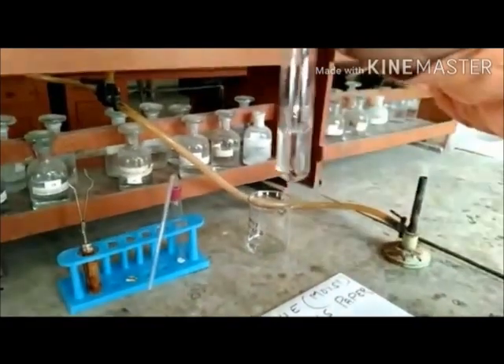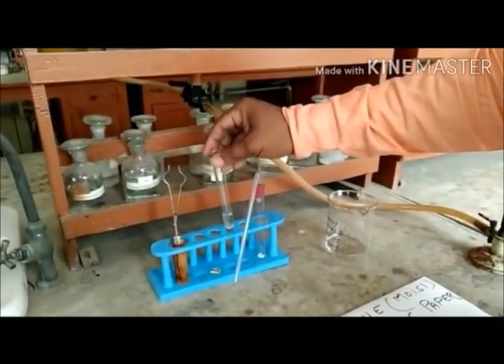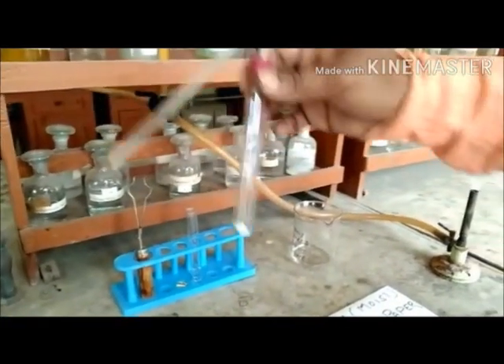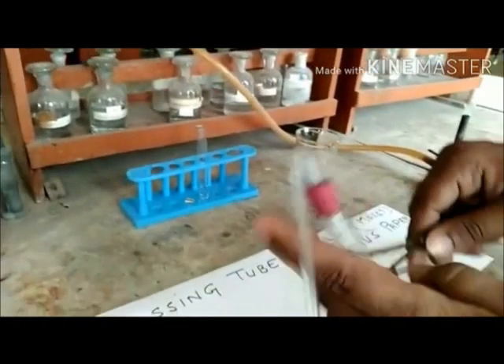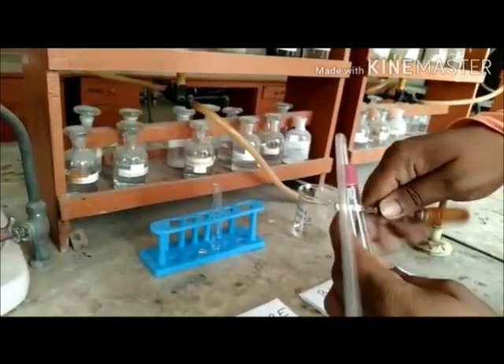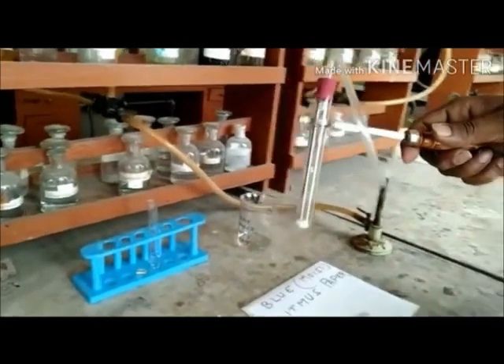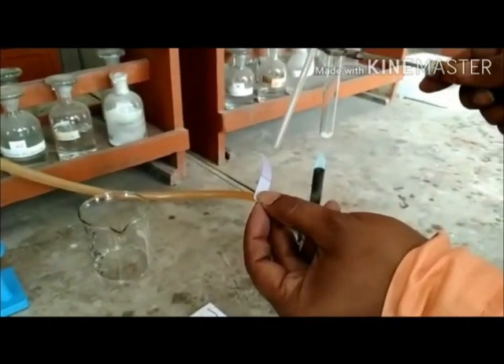As you can observe, we now take back the previous test tube holding it with a test tube holder and place it on a Bunsen burner. We also take the blue moist litmus paper and place it on the mouth of the passing tube.